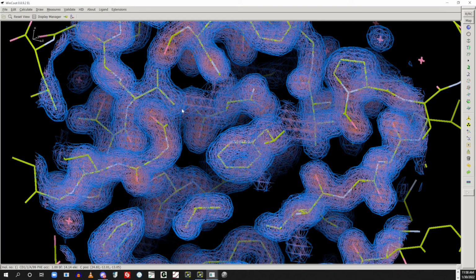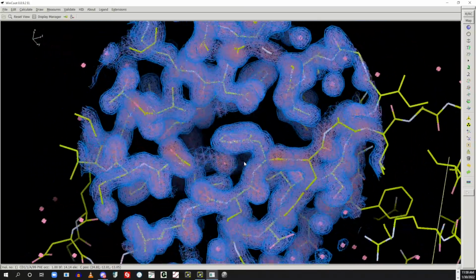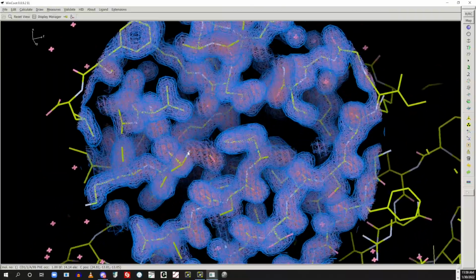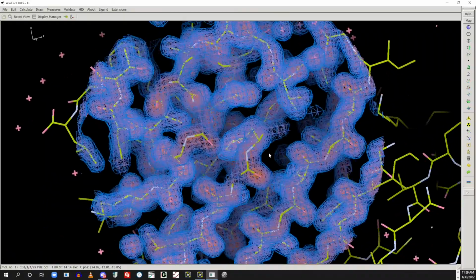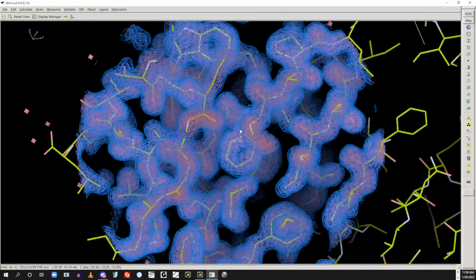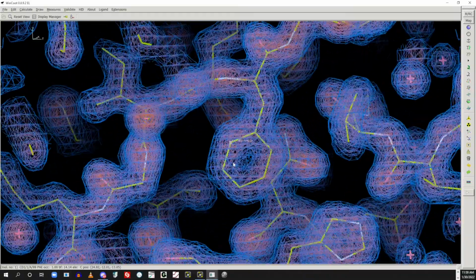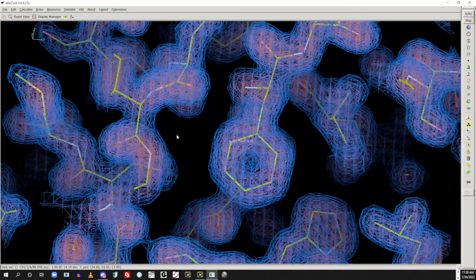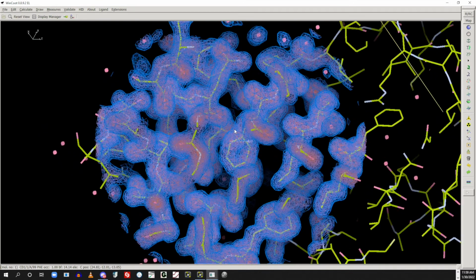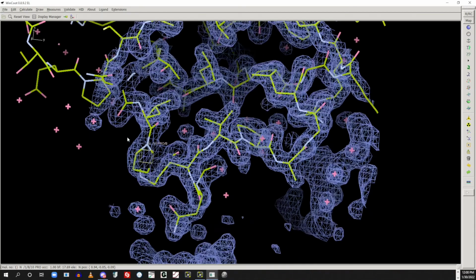And now you can clearly see the depth of density at each XYZ position. As you get more density, the maps get redder and thicker, and you can see that the higher amount of density is at the center of the atom positions in each case. So what I'm trying to show here is that 4th dimension of rho, which is electron density in the XYZ plot.